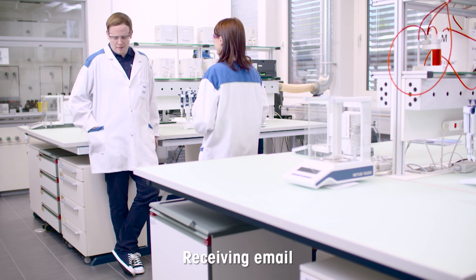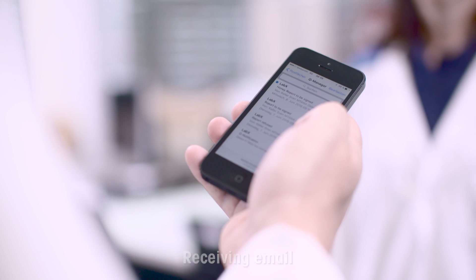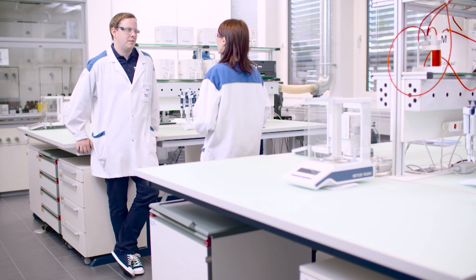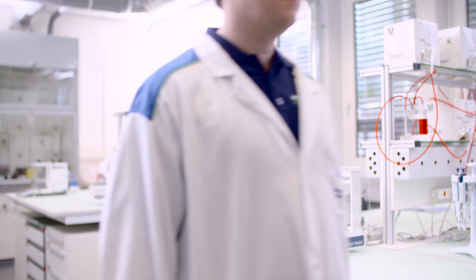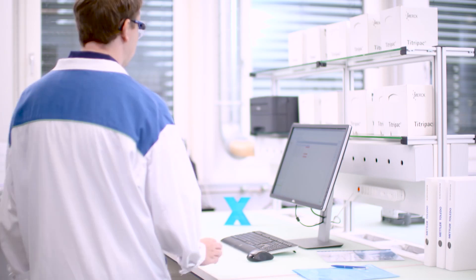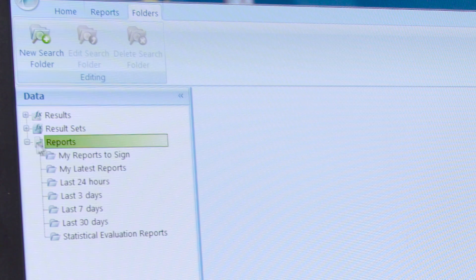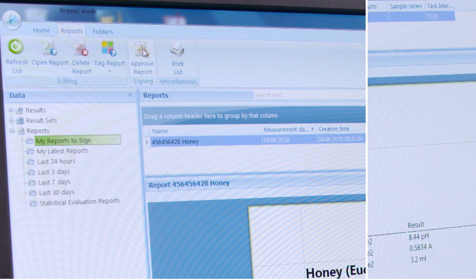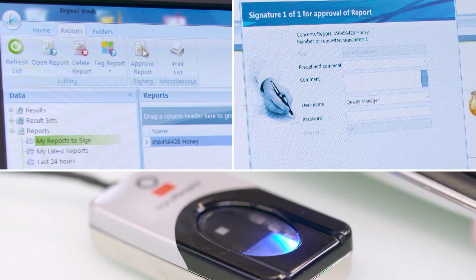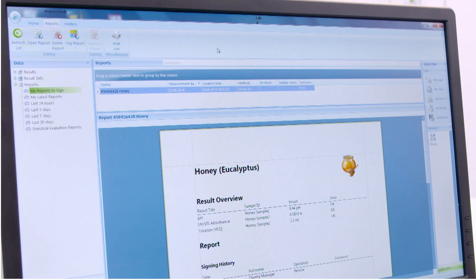The quality manager receives notifications from LabX about reports which are ready to approve. Required users can approve reports by signing in and releasing.